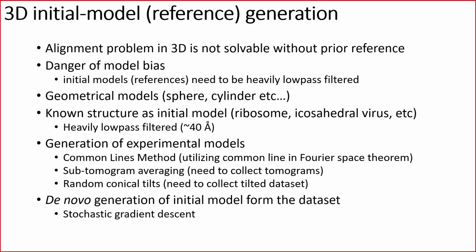In 3D, the problem is a little bit worse because this is not solvable just by a random initialization of our data set, of the reference of the prior. We need to have some initial model. And initial model, in fact, is the biggest problem for single particle analysis, because in single particle analysis, there is always a danger of model bias.